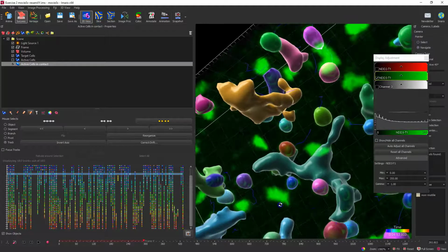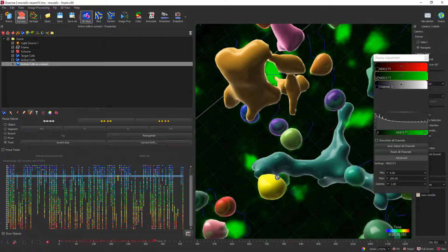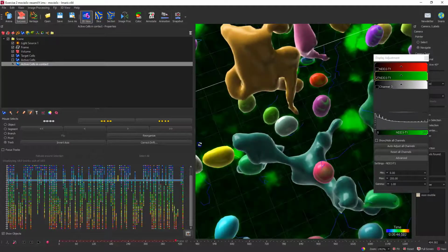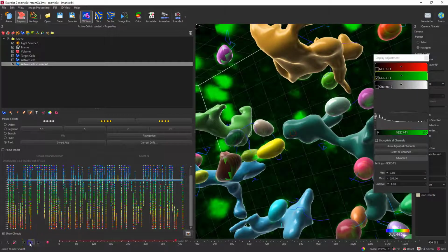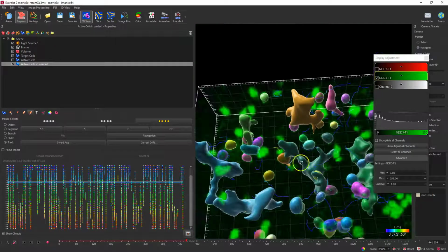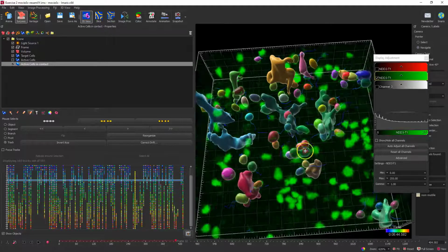Yep, there it is out in the distance. And then as soon as it comes into contact, we track it right there. And we know it's in contact for 1, 2, 3 time points, just a little bit there. It's within 5 microns. That's my 5 micron barrier there. And then after that, it's too far. It moved away already. So we can see that it is actually doing its job, and it is actually giving you the fact that this cell was in contact for a really short period of time.